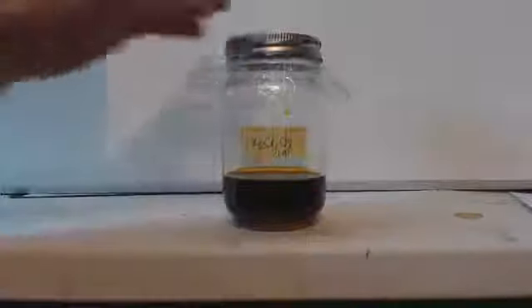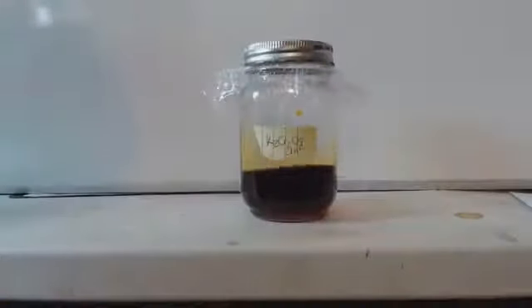Now, I still have this stuff here from when I made potassium dichromate. And this is after the crystallizations and then the recrystallizations. So it's what was left over. It's mostly table salt, sodium chloride. But as you can see, it is a dark color, so it does have some dichromate in there. It looks black, but it's actually really, really dark red. It's just really concentrated. That's the crap that was left over.